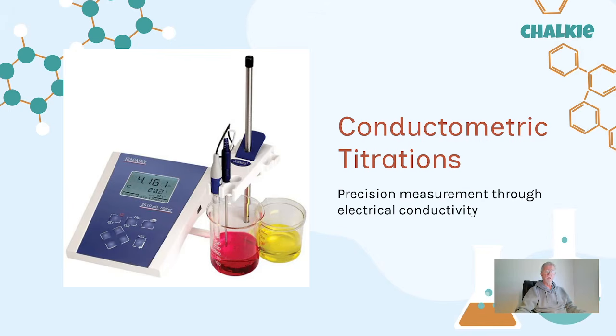Now, we are obviously familiar with titrations. Maybe it's been a little while since you did one, but back at the start of Unit 3, you would have met acid-base titrations. You hopefully have done a couple for yourself. Burettes, pipettes, conical flasks, all the gear.